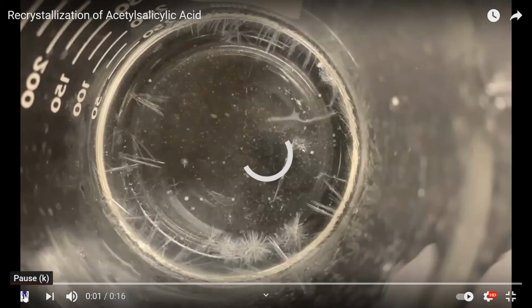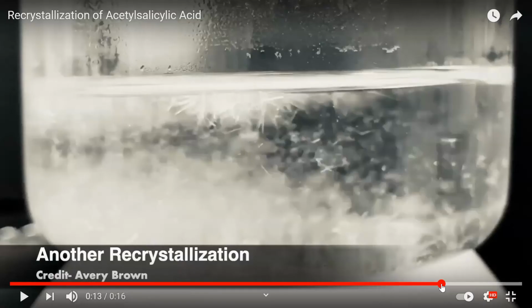So ideally, after the crystals have formed, you still want liquid, and there is liquid there, it just looks full, but there is liquid there by which you can do a filtration, and the liquid will carry out the impurities while the filter paper will trap your pure product. Alright, good luck with your own recrystallization, and don't forget those 4 tricks just in case you don't get any precipitate once the solution has cooled to room temperature.